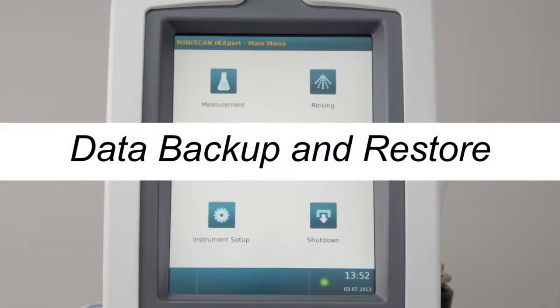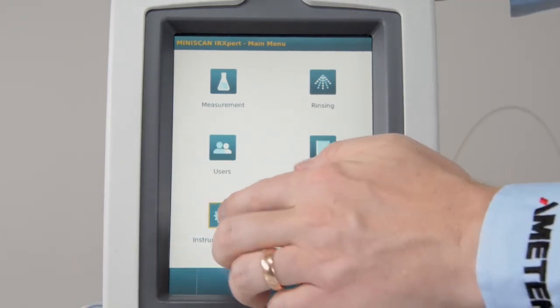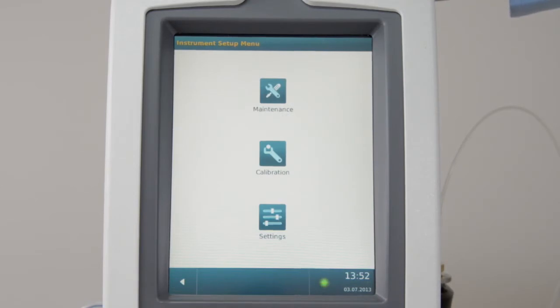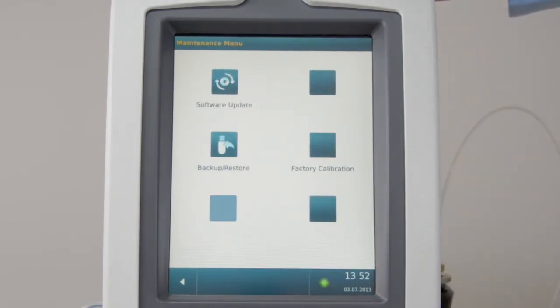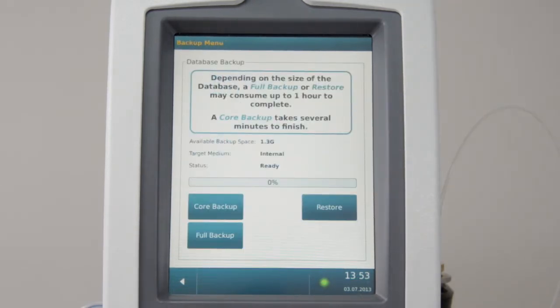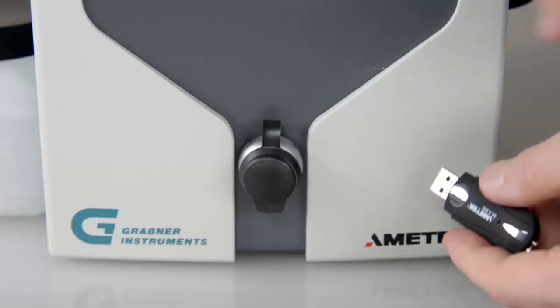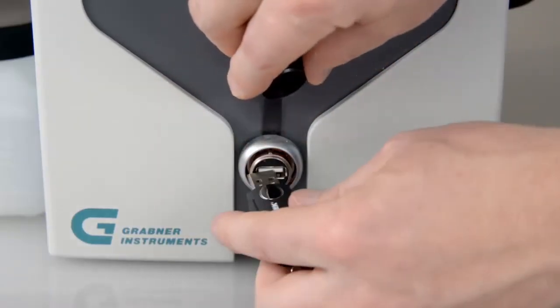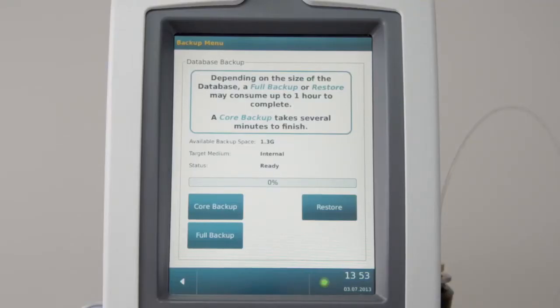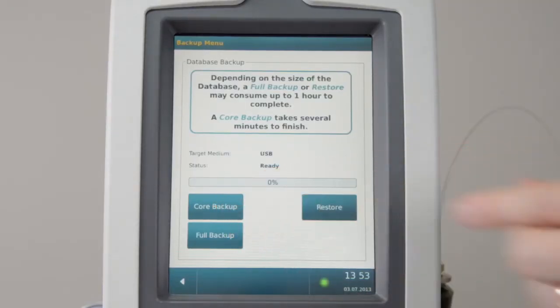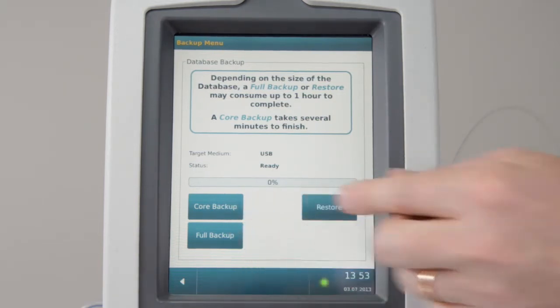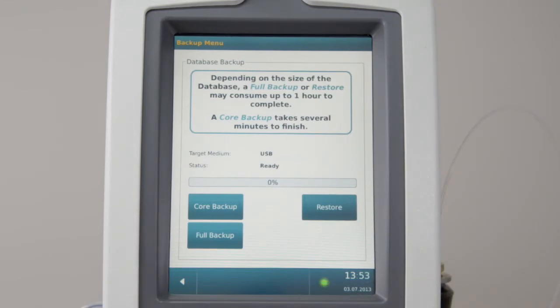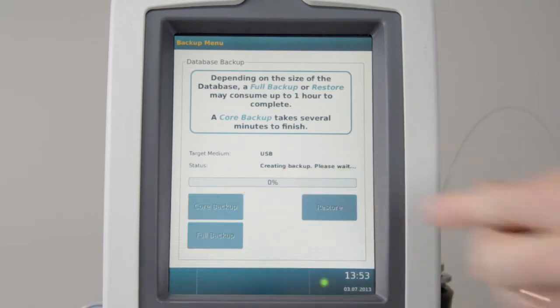Data Backup and Restore. To save your database, go to Instrument Setup Maintenance. Press More and select Backup Restore. The backup can be stored on the internal flash drive or on an external USB flash device. Insert a USB device. Select Core or Full Backup. A core backup will backup calibration data, settings, and results. A full backup will save everything to restore the current status. The backup creates an IR3 export data file.